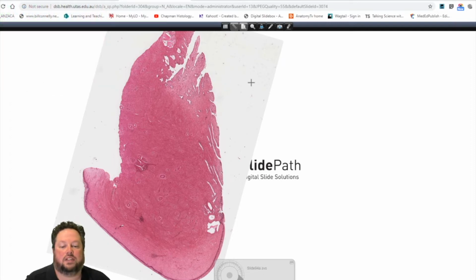Now the cervix doesn't have the same structure that the uterus has, so it doesn't really have a myometrium, and we don't really describe it as having an endometrium, and it's not shed during menses. So it's a very different structure histologically to the rest of the uterus, and it's really the bouncer of the upper reproductive tract, I suppose. It really regulates the movement of sperm, for example, depending upon the phase of the menstrual cycle.